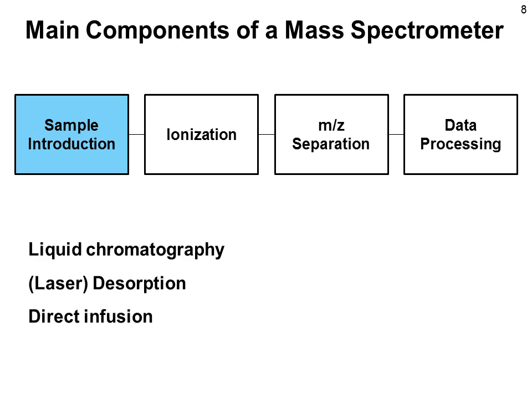Direct infusion is kind of a simple version compared to liquid chromatography. Here we have the sample, for example, in a syringe pump, and this sample is continuously infused into the mass spectrometer. This can be very helpful, for example, for calibrating the instrument with known compounds of defined mass, as we may need some time for accurate calibration. This is done from time to time to either recalibrate the instrument or to check whether the calibration is still in order.